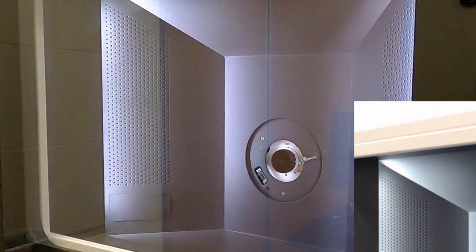And after that, you want to insert the empty holder back into the TEM. Again, my camera is not working now. So you can go back to the very beginning of this video to review the procedures for holder insertion and retraction.